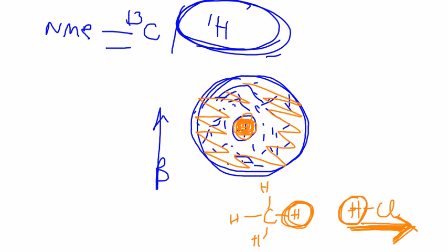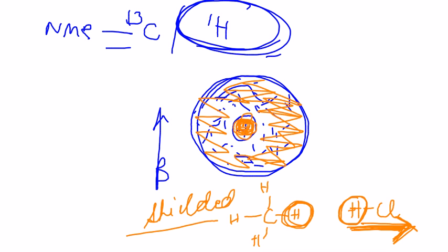they are going to show up at different locations. And the reason for that is because in case of CH4, the hydrogens are not connected to anything electronegative. The electronic environment is still shielding this proton from that applied magnetic field, and so we say that these kind of protons are shielded, or they are upfield. That means in order to be able to see them, you will require a greater amount of magnetic field.